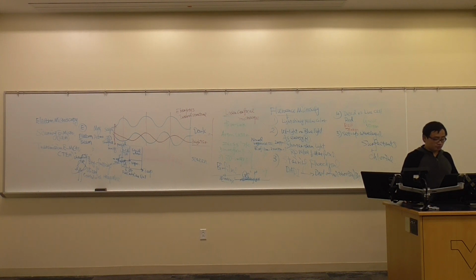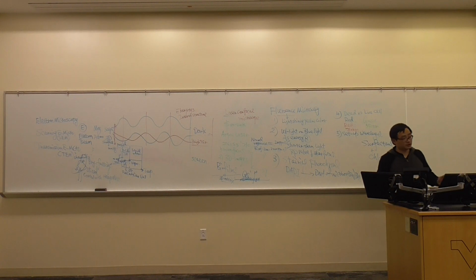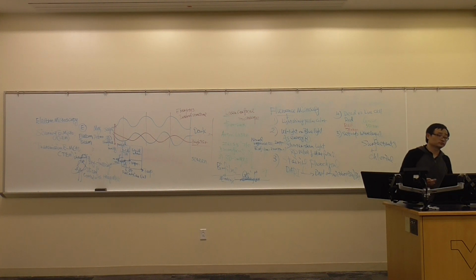Height using 0.25 or 0.5 is dramatically, significantly higher than the other treatments, and the roughness is significantly decreased. So that shows you what the morphology of the foodborne pathogen looks like after treatment with antimicrobials. Okay, so that's why I wanted to introduce these things to you.